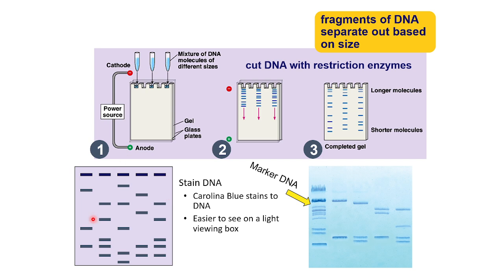occurred. So you can see a lot of things in a gel when you are doing restriction digestion, or even when you want to run the intact plasmid. Usually in an intact plasmid you observe 2 to 3 bands because of the CCC circular supercoiled structure. You have the linear form and the circular form.